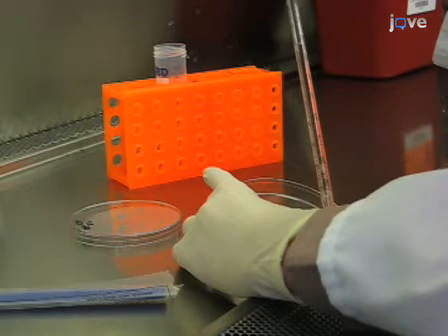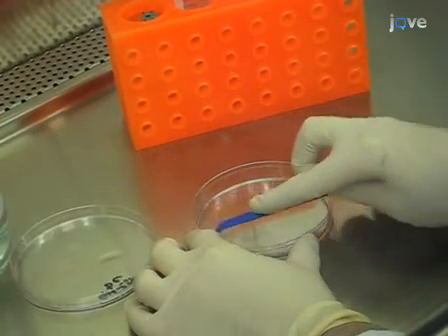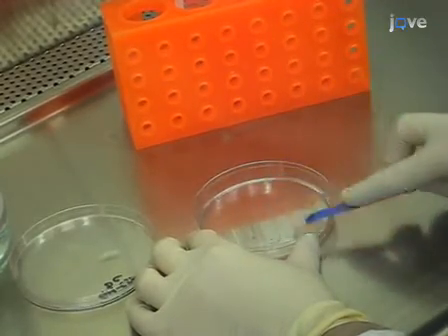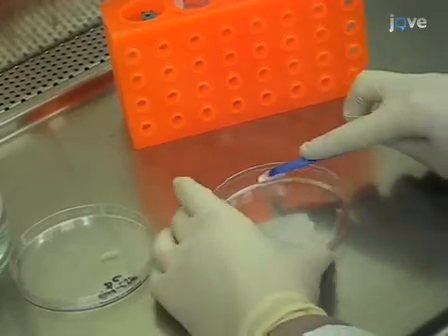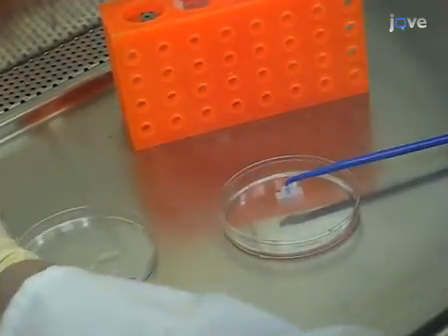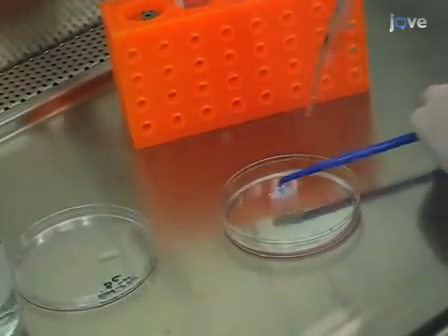On the sixth day, refresh the media by replacing one-third of it again with GMCSF-containing media. To harvest the cells on day seven, remove the media which contains non-adherent DCs and collect in a conical tube. Scrape the dish using a tissue culture scraper, then rinse the scraper and dish and add this rinse to the non-adherent cells in the conical tube. At this point you may begin your experiments — your DCs are ready.